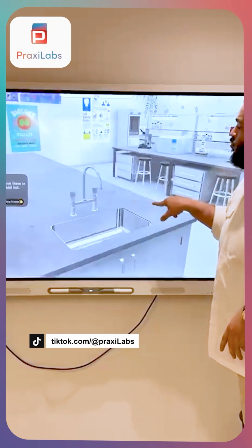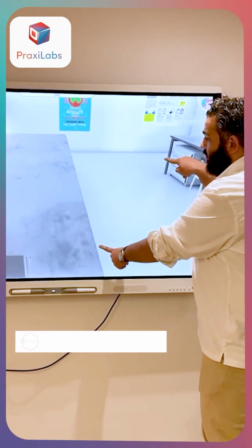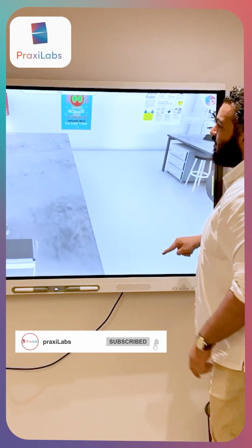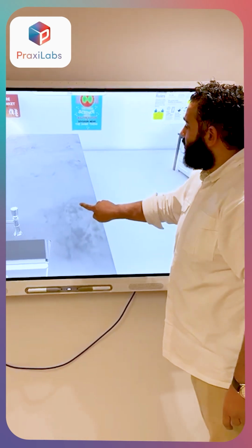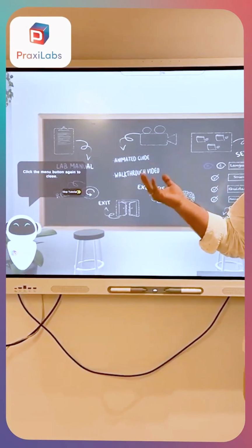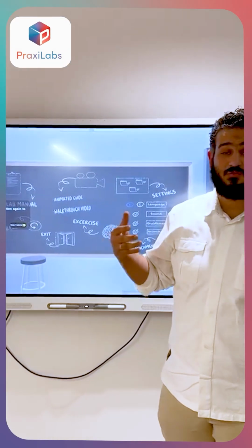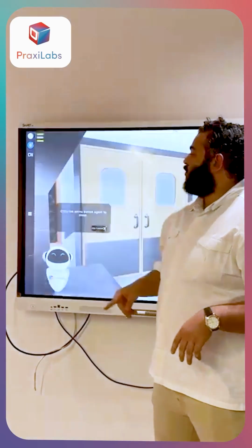Now I'm going to show you how our lab is an interactive lab. You can move between the bench and see different perspectives. Also, you can zoom in and out simply like that. Otherwise, by clicking 3 steps, you can get back to the default position. Now, we're going to introduce our menu that has many options and tools that can help your students understand exercises, as well as evaluate themselves after or during performing the experiments. Let's get back to our lab.